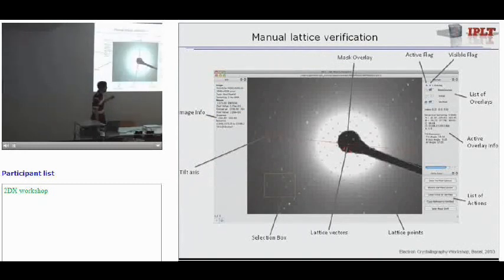If this one here would be off by one unit cell, then the lattice points are sort of on a circle. If you go to that circle and look at the background values you have, then of course if you are not hitting the right zero, the background values would not be equal. They would have an enormous sigma. And the question is whether you could automatically correct for that, just using this information.